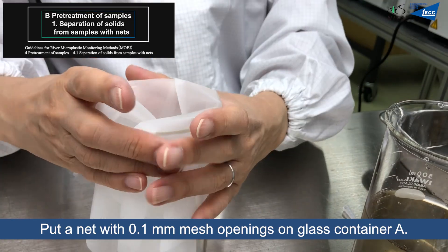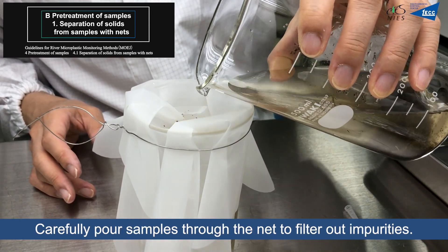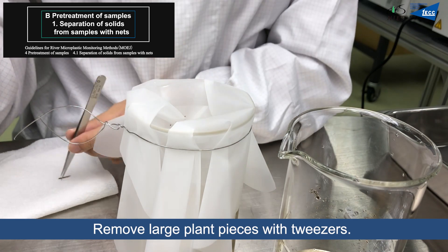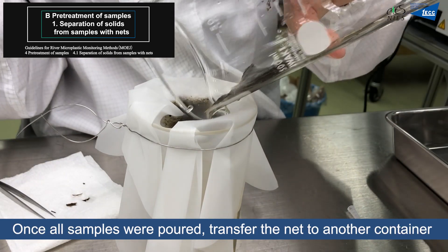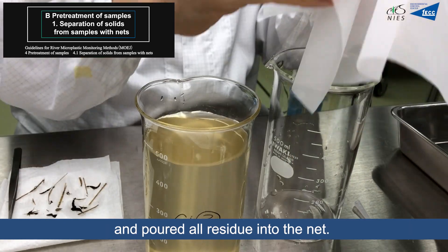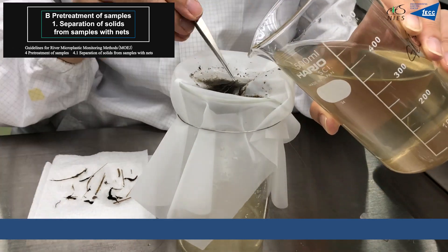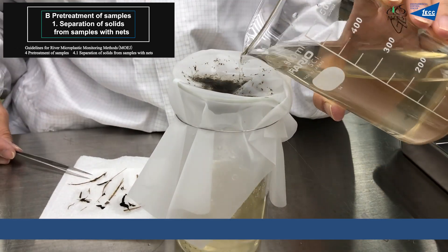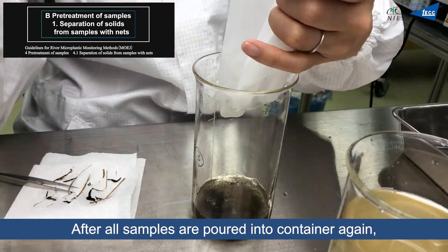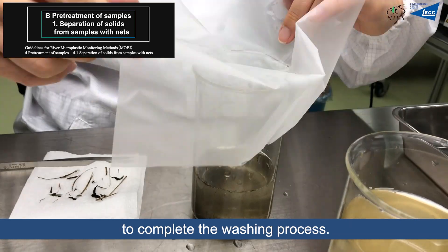Place the net with 0.1mm mesh openings on glass container A. Carefully pour samples through the net to filter out impurities. Remove large plant pieces with tweezers. Once all samples have been poured, transfer the net to another container and pour all residue back into the net. After all samples are poured into the container again, the remaining samples on the net are transferred to another container to complete the washing process.